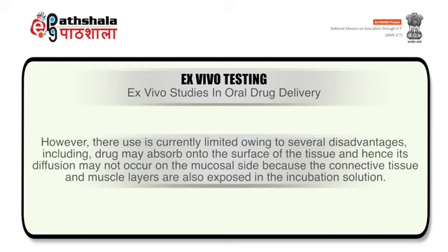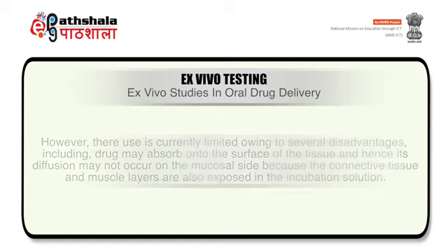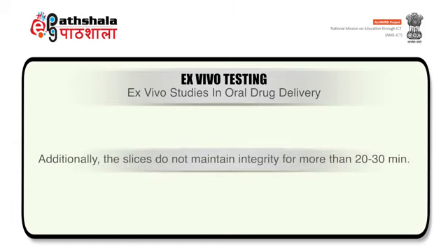However, their use is currently limited owing to several disadvantages, which include that the drug may absorb onto the surface of the tissue and hence its diffusion may not occur on the mucosal side, because the connective tissue and the muscle layers are also exposed in the incubation medium. Additionally, the slices do not maintain integrity for more than 20 to 30 minutes.